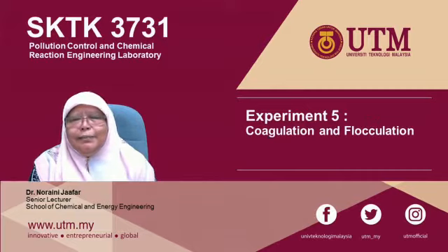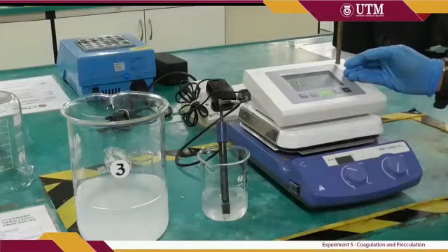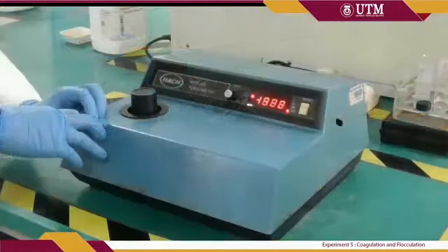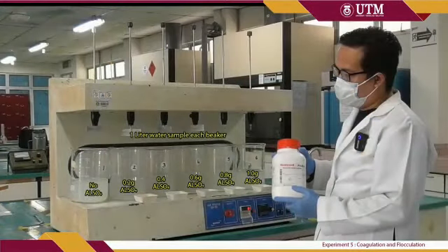For this experiment, I will be assisted by Mr. Ahmad Bukhari. The equipment that we will use in this experiment is the pH meter, the turbidity meter and the jar test equipment. And we will also be using aluminum sulfate as the reagent.